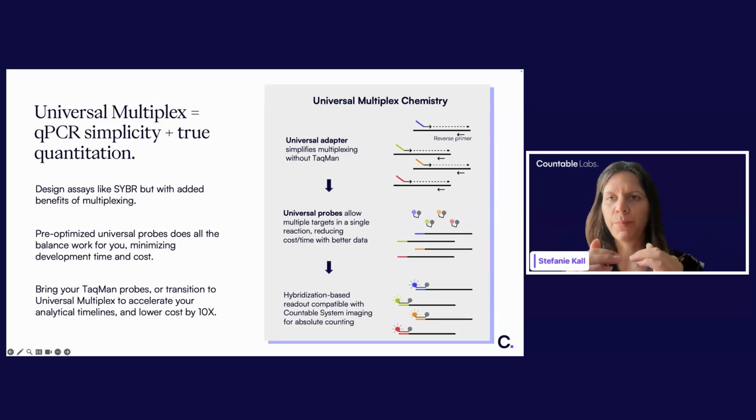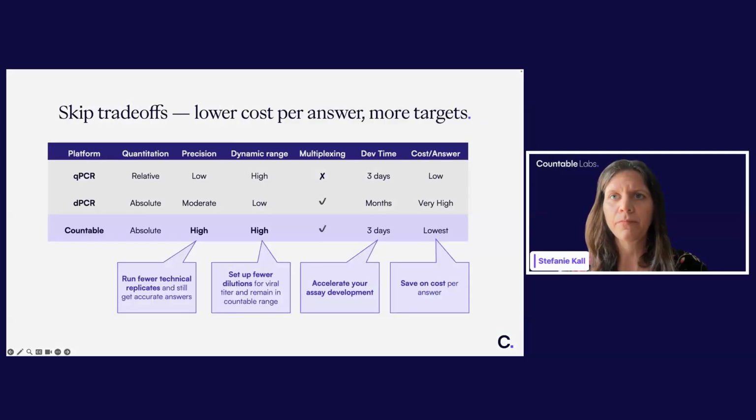So what happens is when it binds, the quencher of the probe kind of releases it and the probe gives signal. So you can see it's pretty straightforward technology, but it allows you to do this hybridization-based probe that ends up costing a lot less because you're just buying standard oligos in order to design this experiment.